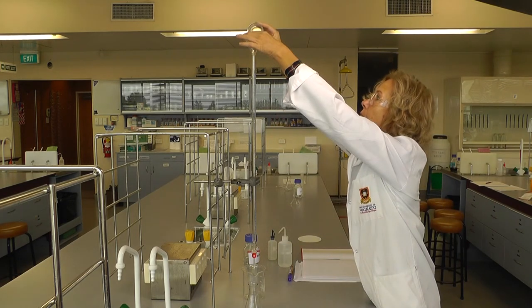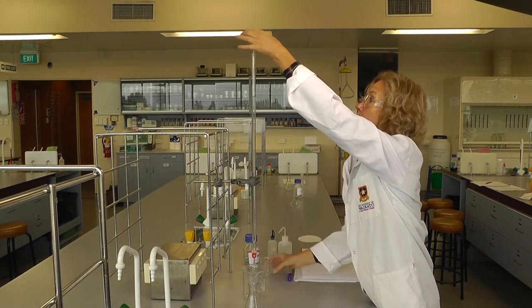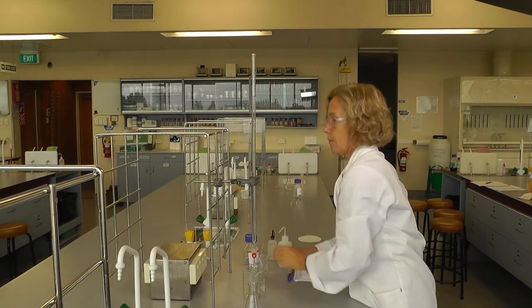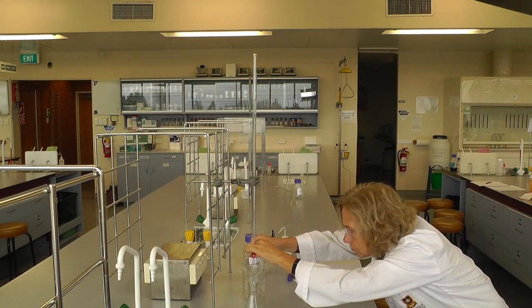Close the tap and fill the burette with stock solution. Remove the funnel. Check the jet for any air bubbles. To get rid of these, drain some solution from the burette.